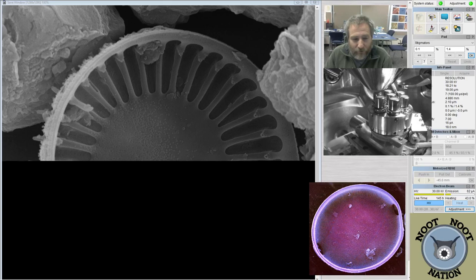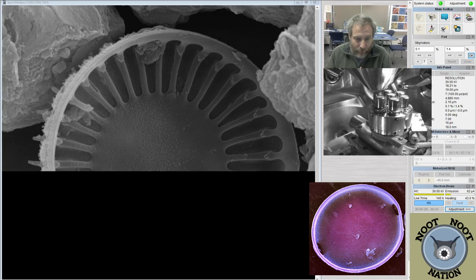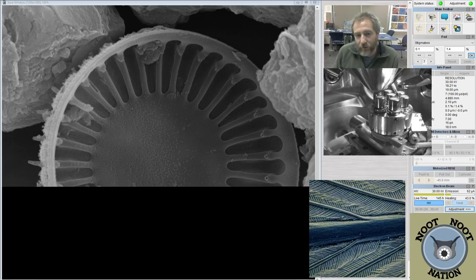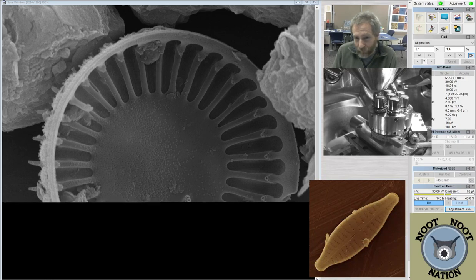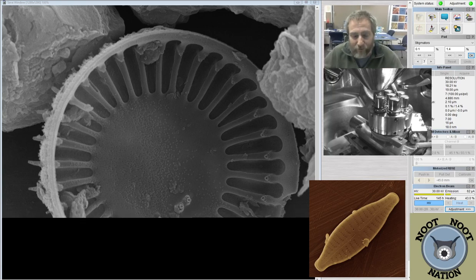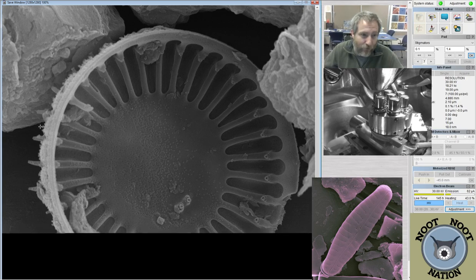But it also means that they need more silica if they produce spines. It's just like an ornamentation on the outside of the valve. And so it requires a bunch of silica, though, to make the spines. And if you took them out, it would reduce the amount of silica required by the diatom by quite a bit. Relative to its actual proportion, it might be something like 15% maybe of the total mass of silica on a valve. So I'm just thinking about how much extra silica that is for something that we don't even know what the spines do for the most part.